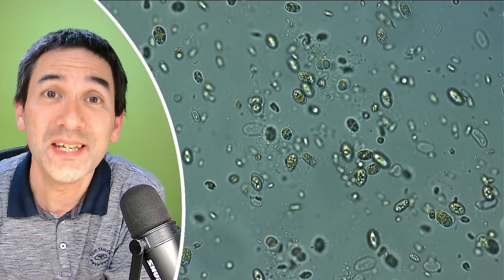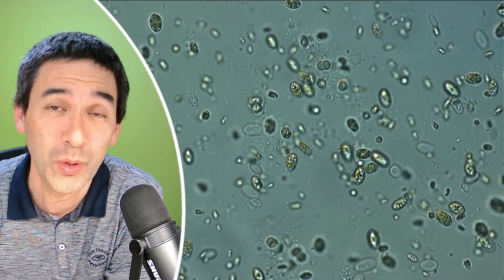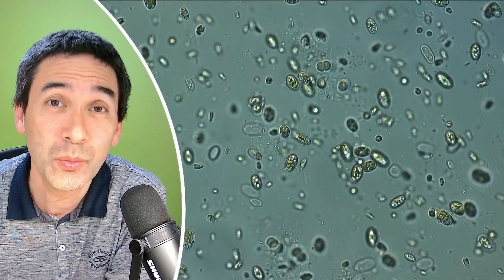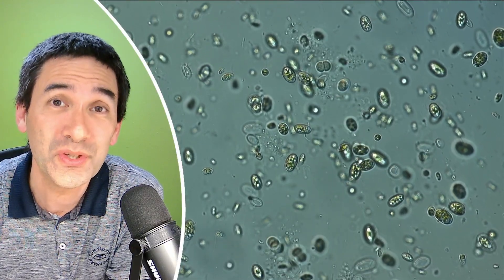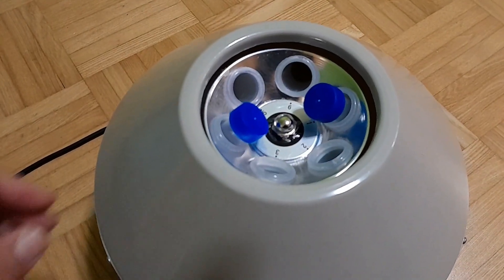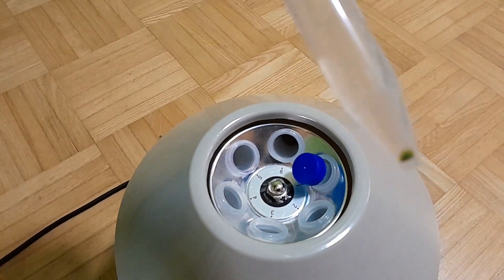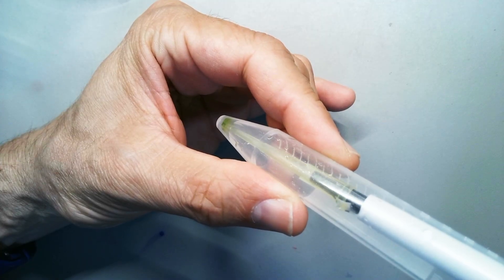I used a centrifuge to concentrate that sample, because the water sample itself, even though it looked very green, the cells that were in there were not concentrated enough. So I placed the water sample for five minutes into my centrifuge and re-suspended the pellet — the little green concentrated thing that collected on the bottom of the tube. That's the pellet. And I re-suspended it and put it under the microscope.